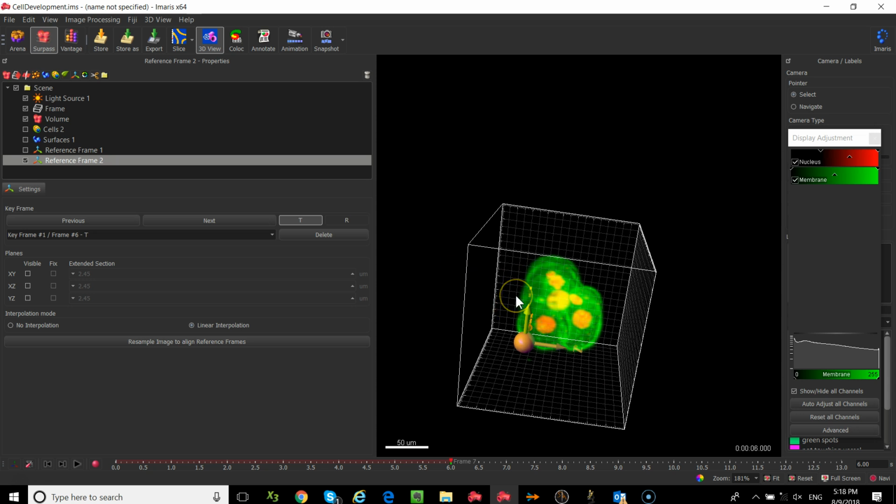But you now have this new reference point, okay? A new 0 point that is separate from the image axis. Now I just moved this translationally. Did I say that word right? Translation, yes, I did. Okay, you can also rotate it. So if you're looking at something that's off axis, instead of having it be in alignment with your image axis, you can also rotate. And you can do that by, when you're in select mode, grabbing one of your axes and rotating it in a particular direction.